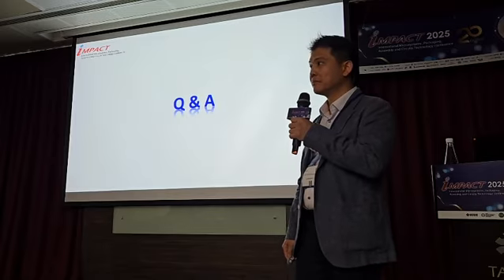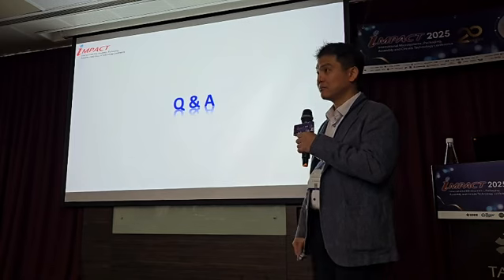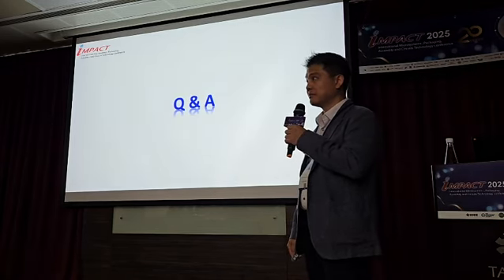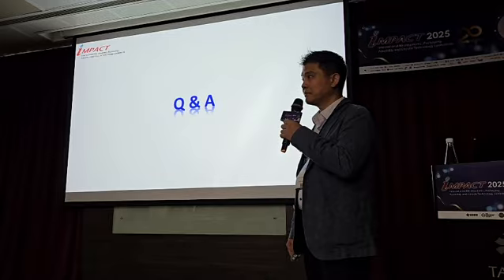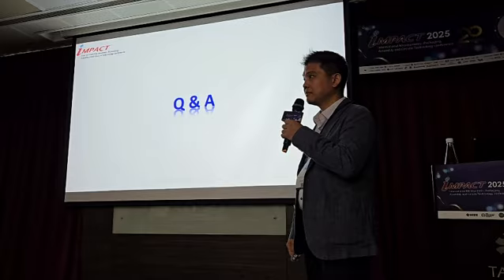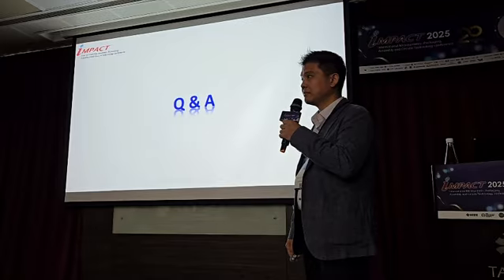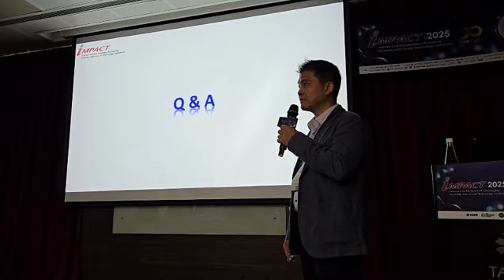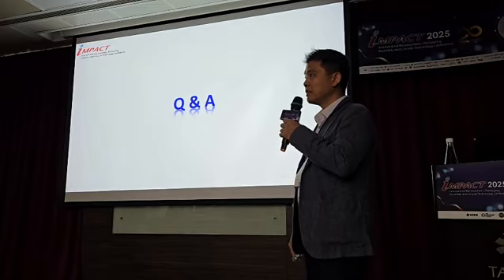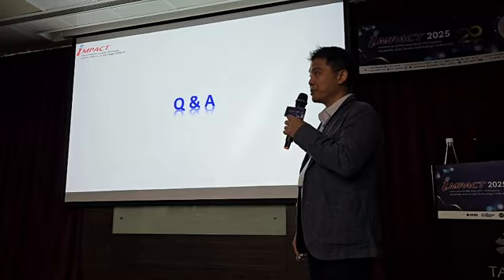Question: In terms of element detection or molecular detection, should we prepare, for example, micro joints through a cross-section process first and then use your detectors? It depends on the sample geometry that you're looking at.